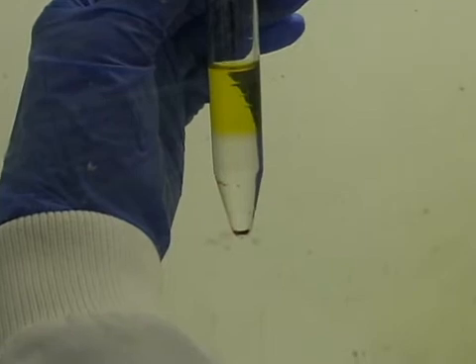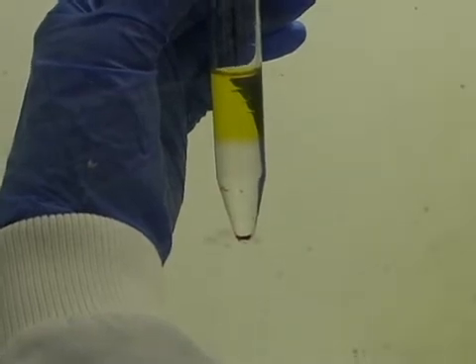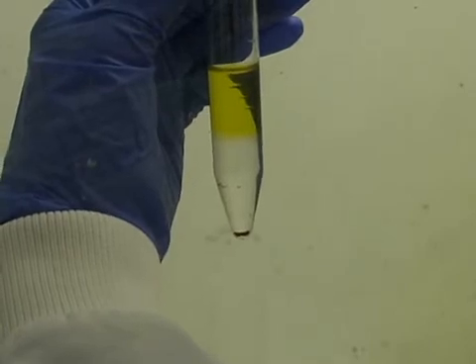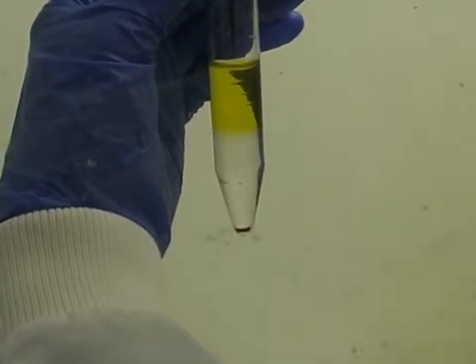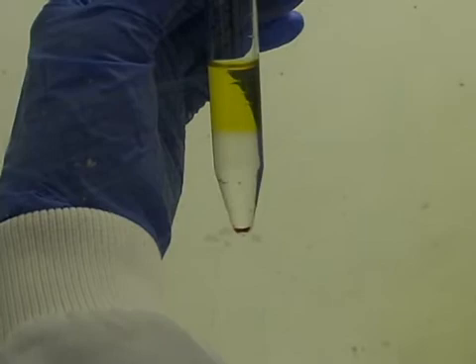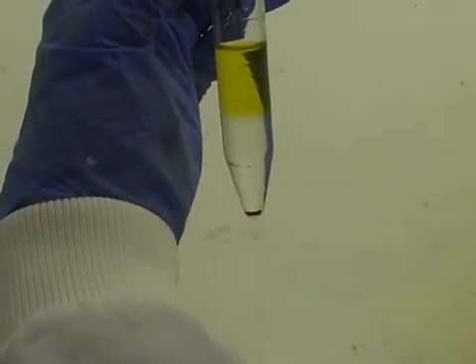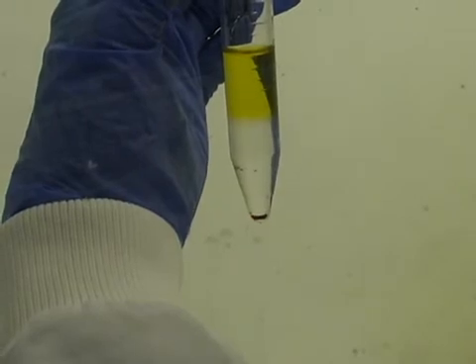This is a technique we use for bloody samples. If we receive bloody effusions, pleural or ascitic samples, we have to split the cells from all the blood. So we use a blood separating technique called histopake. It's a density gradient separation.